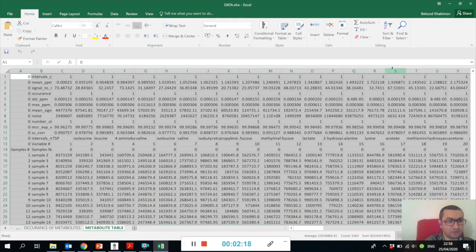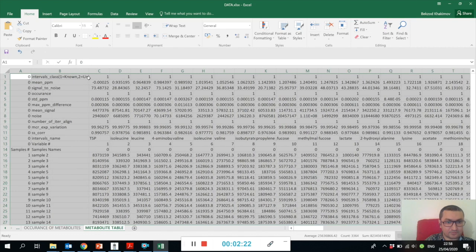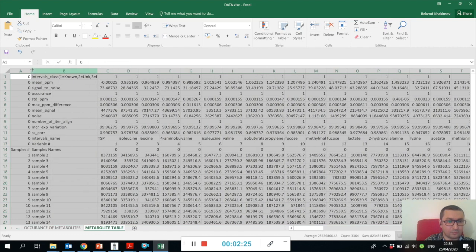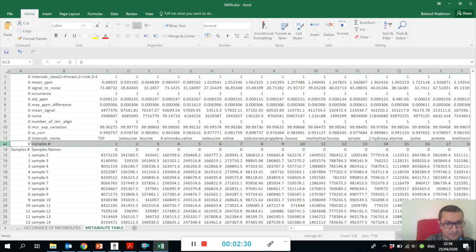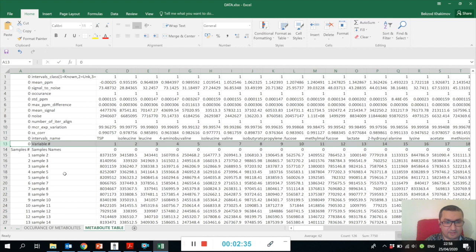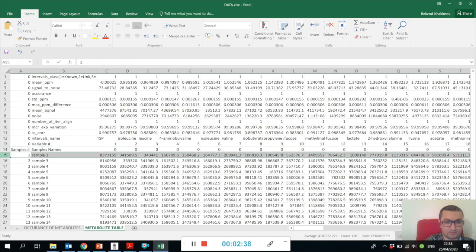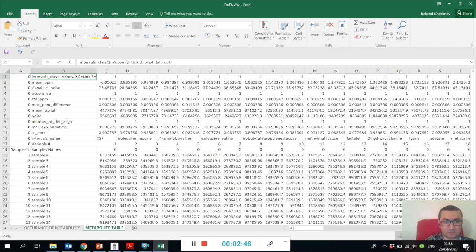You can open it using MATLAB or you can just double-click the Excel sheet, and here you will see how your metabolite table looks like. Let me show you - here we have the metabolite table.